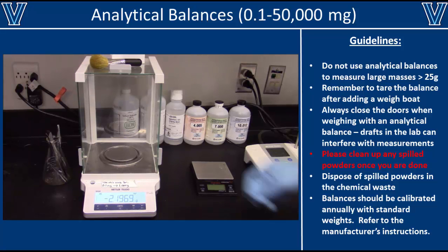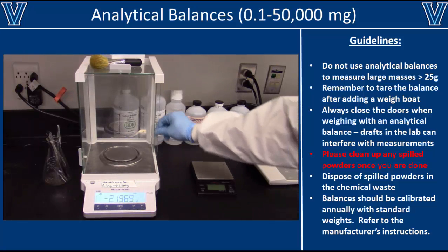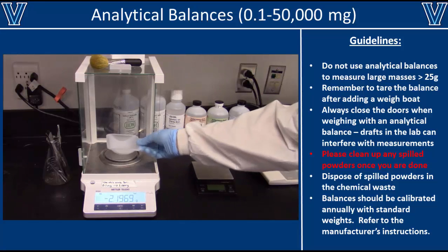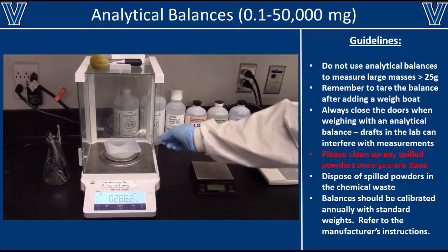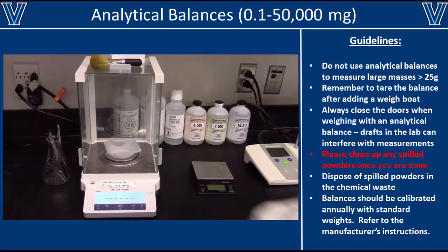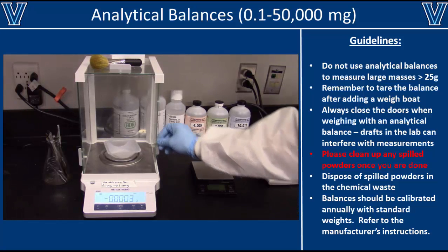To weigh masses larger than one gram, use a weigh boat. Insert the weigh boat into the analytical balance, close all the doors, and tare it to set the mass to zero. Then add your chemical.